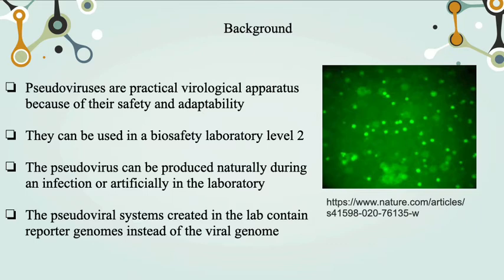Alternatively, you can produce SARS-CoV-2 or Ebola pseudoviruses displaying the viral spike on the surface of viral particles that lack the viral genome. For that reason, these pseudoviruses are not able to produce viral progeny. Instead of the viral genome, pseudoviruses contain a DNA reporter genome. Reporter genomes have genes that, when introduced into a target cell, will produce a protein or enzyme that will provide a signal for the successful attachment and entry of the pseudovirus into the host cell.